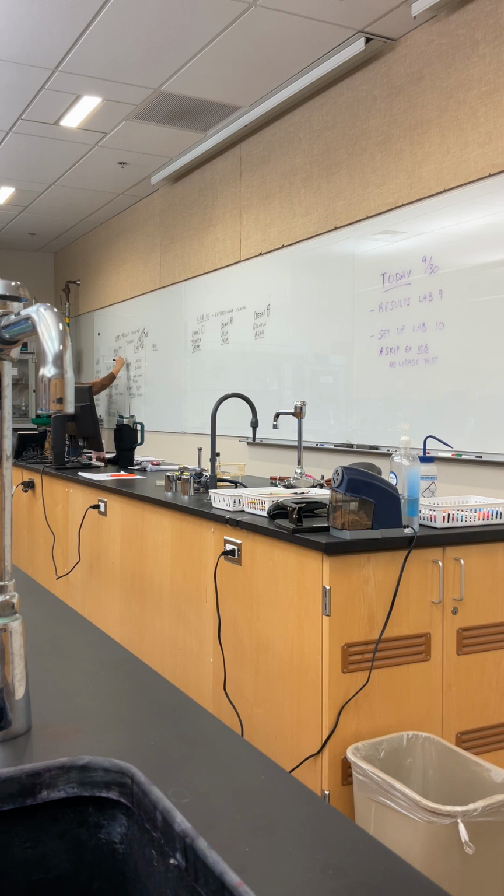So the sugar is going to be differential. You can see why we're going over this. It gets really confusing. So you want to sit there and kind of look at this. So my sugar is going to be differential. That's going to give me a visual difference between the two. Who loves lactose? Who makes the most acid? Who causes a pH shift?